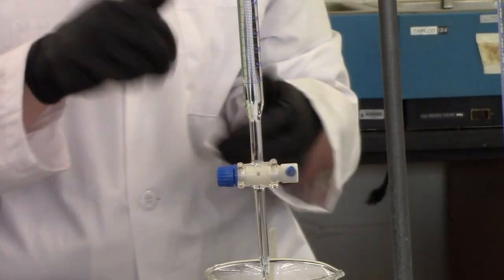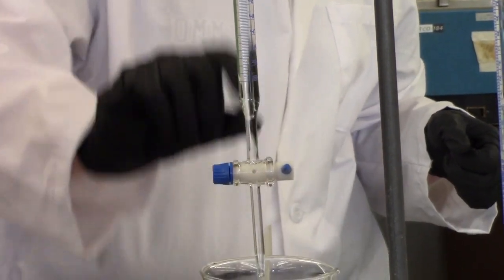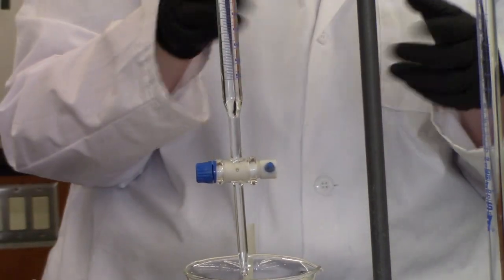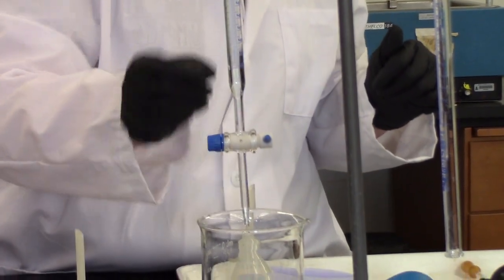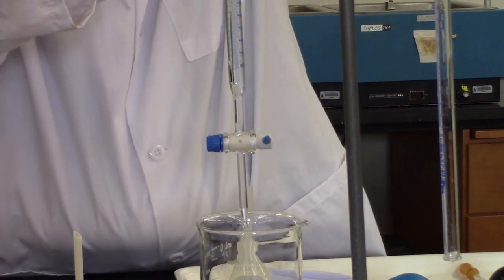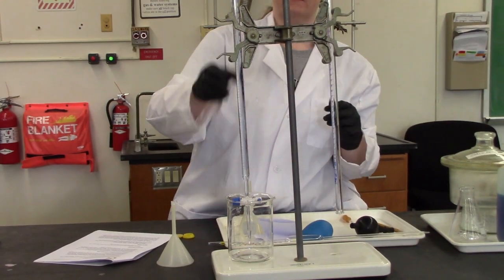It can take a little bit of patience to get all the bubbles out, but it's really important that you do, because if there is a bubble trapped in the end here where we can't measure, it's going to fluctuate in size. Gases expand and contract depending on the pressure and the temperature, etc. So we want to make sure that there's no bubbles in here. Now, I have a volume up here that is not zero anymore because, of course, I drained some of it out, and that's okay. That's not a big deal.